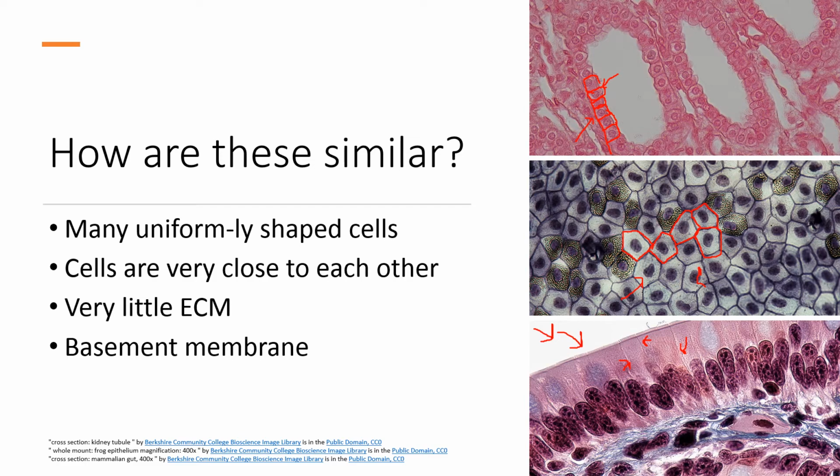The other thing I notice is that there's very little ECM separating the cells. Remember, that's the material, can be liquid, solid, jelly-like, but it has protein fibers in it, and it's supposed to separate the cells. Not really seeing a lot of that here anywhere.